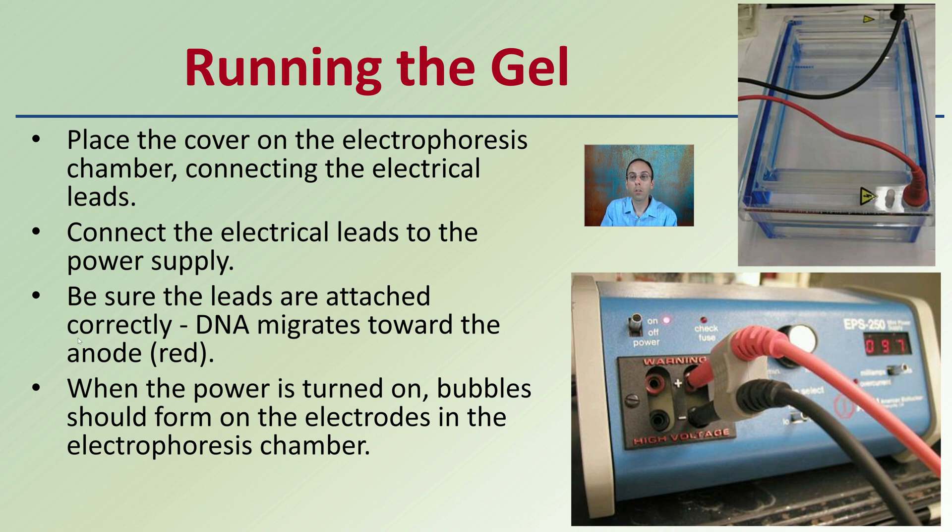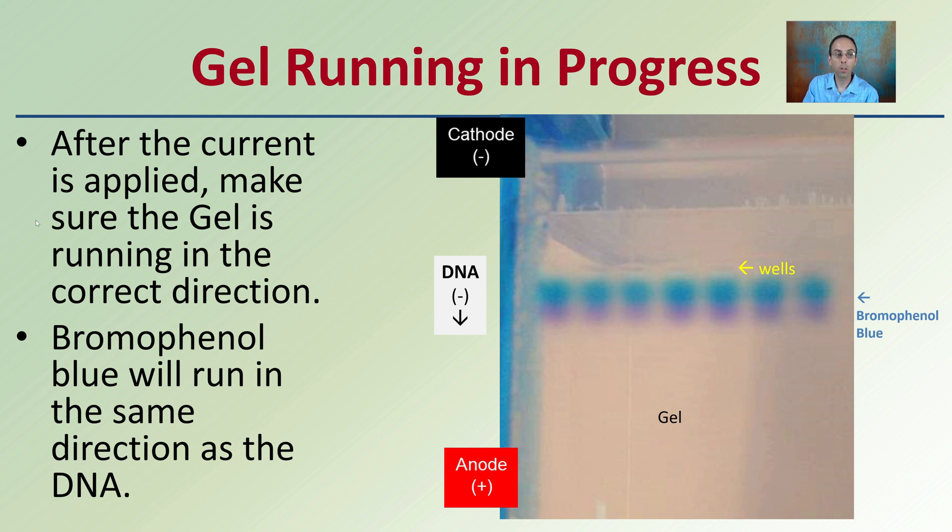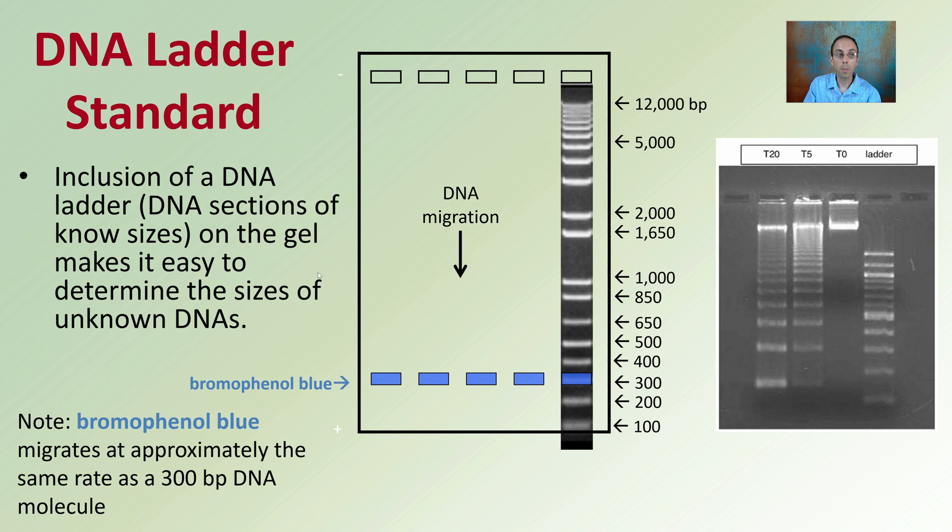Be mindful that this is an electrical hazard when the power is on. When the gel is running, make sure it is running in the correct direction — double and triple check this, otherwise you might lose your entire experiment. Bromophenol blue runs in the same direction as the DNA, and you can see it moving toward the anode, confirming correct setup. A DNA ladder is also recommended — sections of known sizes that look like rungs of a ladder — making it easy to determine the sizes of unknown DNA fragments by comparing them to your sample. Note that bromophenol blue migrates at approximately the rate of a 300 base pair DNA molecule, so a darker band in that area may simply be the dye.